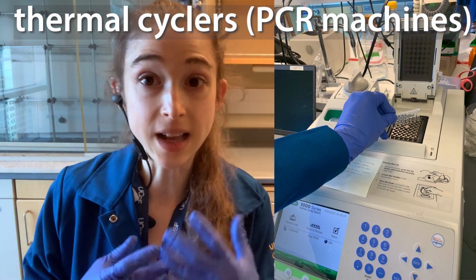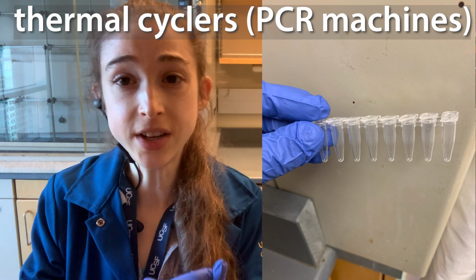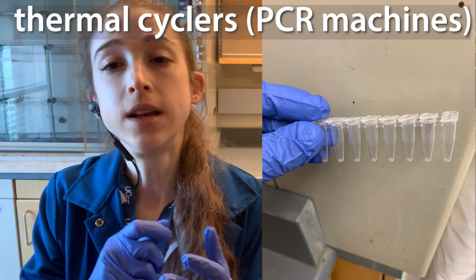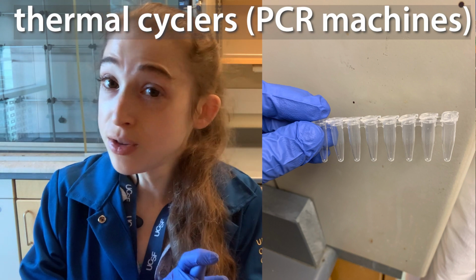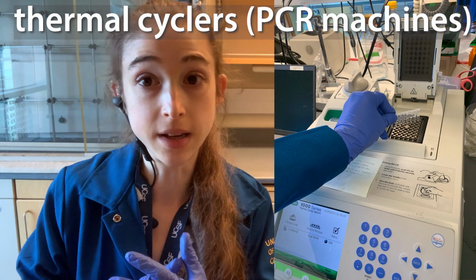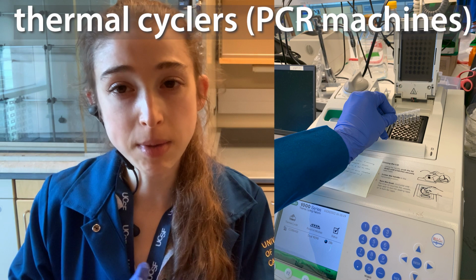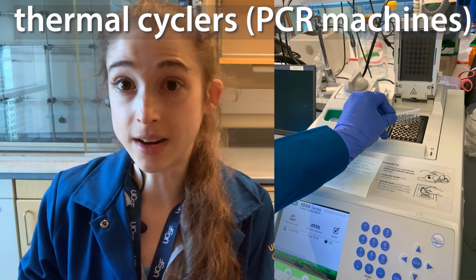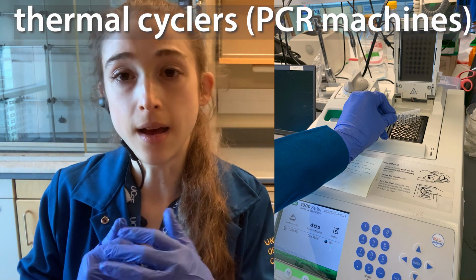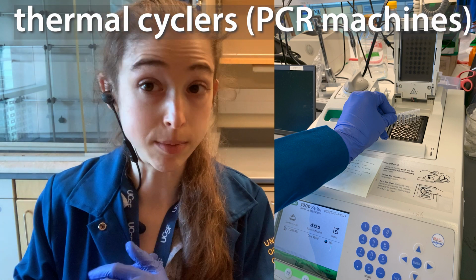And then we can use it as an incubator for PCR strip tubes. The limitation here is that your samples can only be about 200 microliters or so, which is really, really small. So we have other devices that we can use if we need them. But these small reaction tubes can come in really handy for a variety of purposes, various reactions that we may be doing, as well as if we have a lot of gel samples we need to heat up, and so boil before we use them for a reaction. And so that can be good for that.